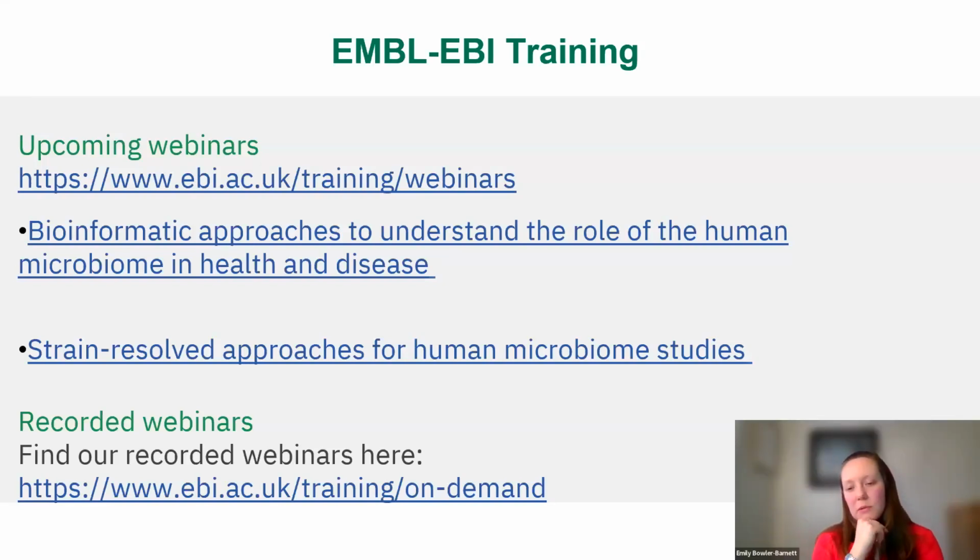So our TrEMBL sequences are all imported. And they're all imported from, annoyingly, I don't have this slide on me. I think this is a different webinar I'm thinking of, but we have a set of resources, Ensembl, ENA, etc., that we import the sequences from. So if they're statistically significant and they're confident that they exist in ENA and Ensembl, then they're in our website. So it isn't us that do those particular confidence queries. It would be the other databases, and then we import them.